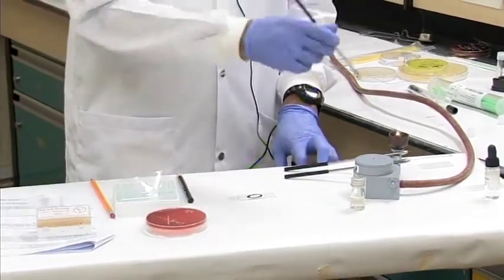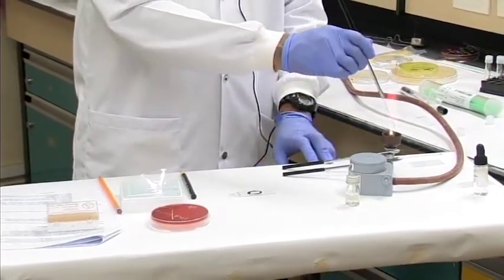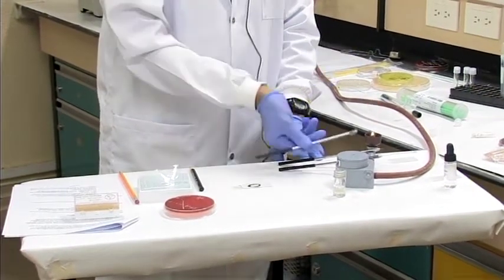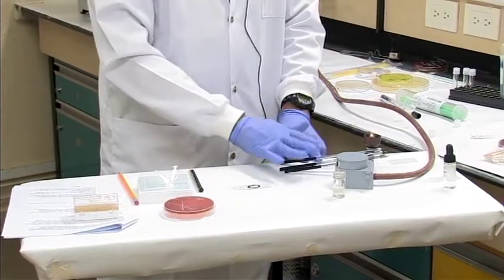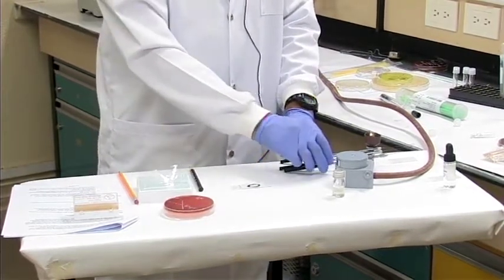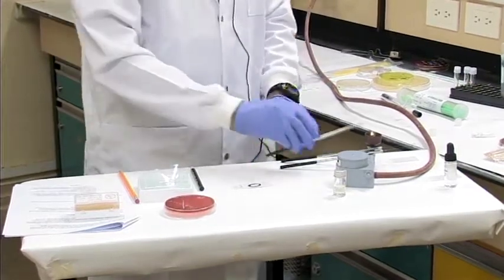After using the loop, of course, you must flame it again before putting it back down, because you don't want to use a loop that has bacteria or any other substance on it. And now we use 3 loops or so, so when one is cooling, the others would have cooled already. Now we're going to add our bacteria to our slide.